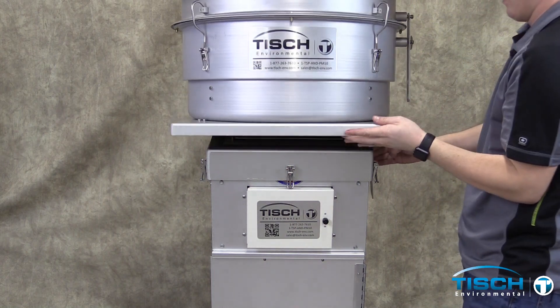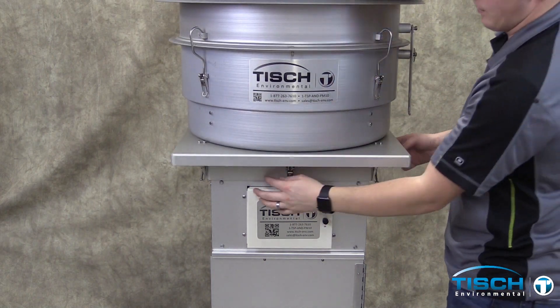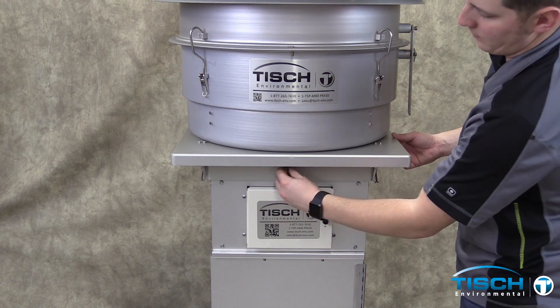Unlock the PM10 inlet and place it down on the bottom pan. Re-fasten the six latches.